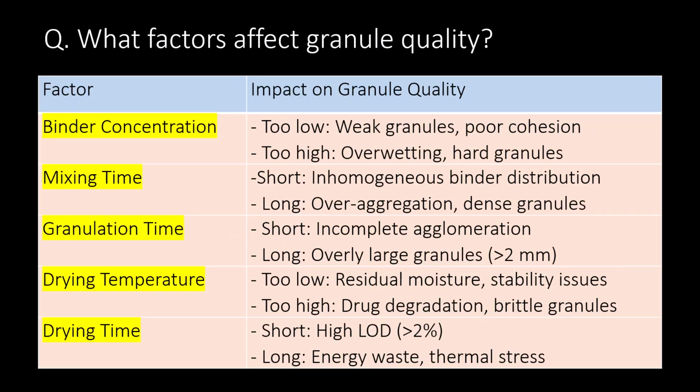Important question, what factors affect granule quality? Binder concentration, mixing time, granulation time, drying temperature, and drying time are the factors that affect granule quality.